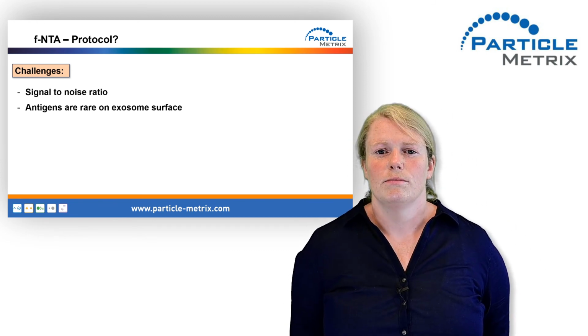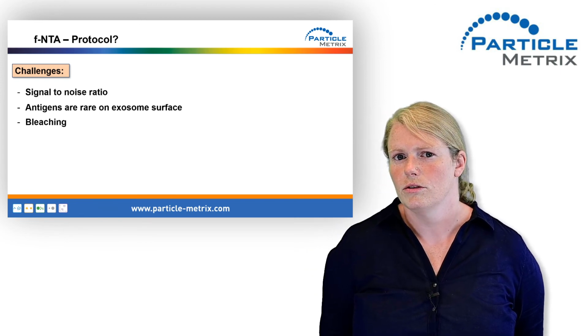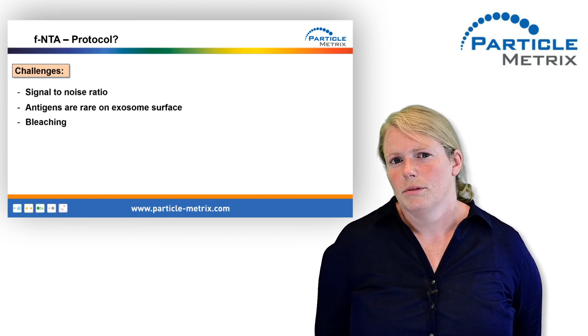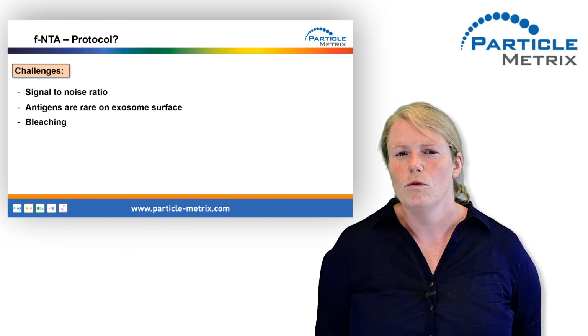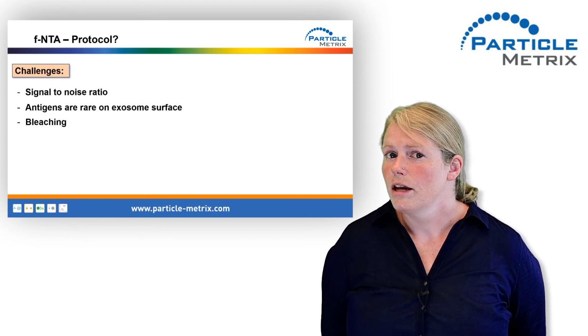And we are dealing with bleaching. Why is bleaching such a problem? In flow cytometry you don't talk about bleaching. Why do we do? In flow cytometry your particles run through the laser beam and are instantly analyzed. But we do a tracking analysis, which means we have to follow the movement of the particles at least for half a second. So we have to care about bleaching.